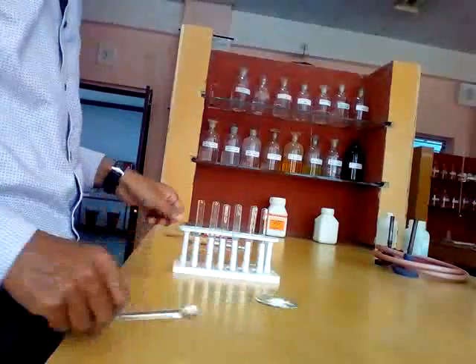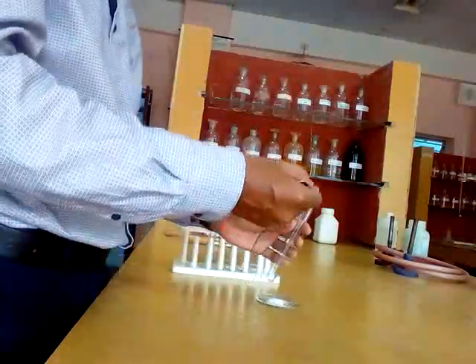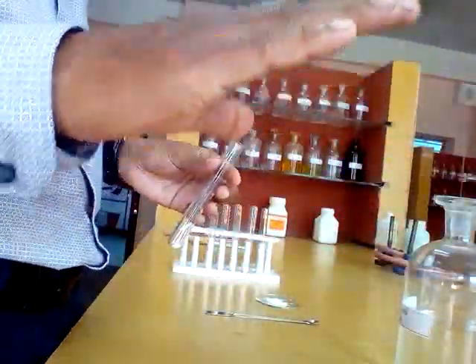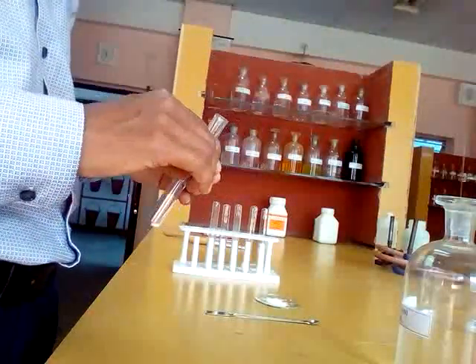For the dilute sulfuric acid test, you take some dry salt in a dry test tube, then you add dilute sulfuric acid. This is the dilute sulfuric acid. After adding dilute sulfuric acid, if you observe effervescence, that indicates carbonate radical.